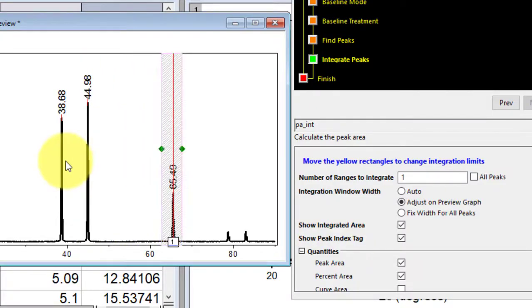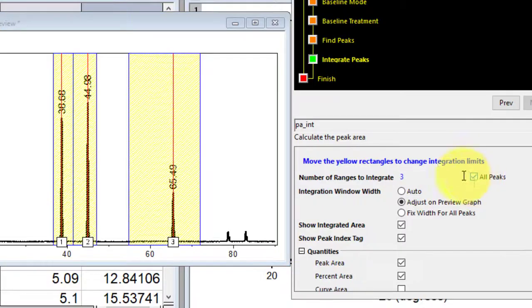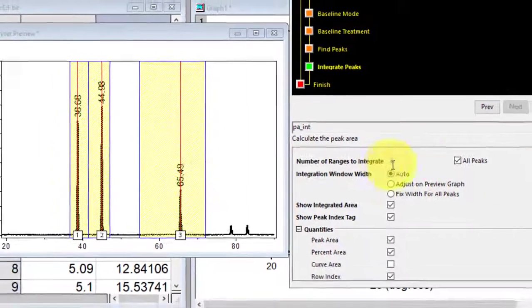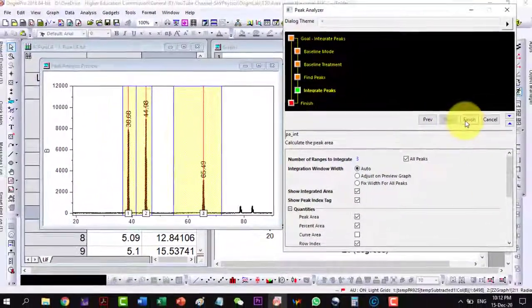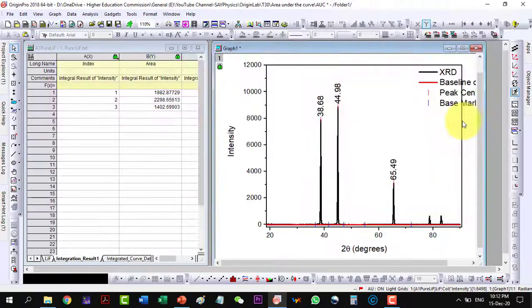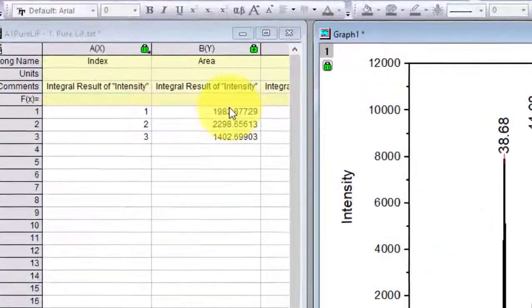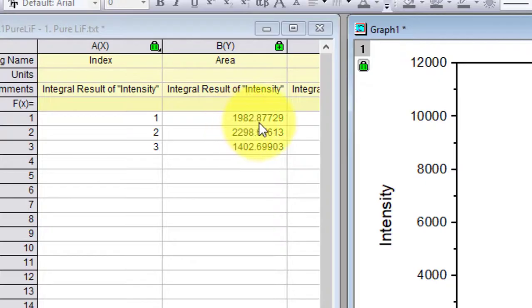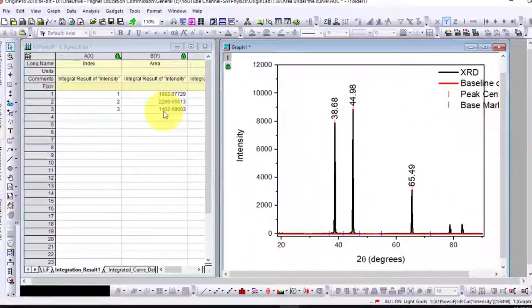So it can be done manually as well, but it is always better to find out the area under all peaks, so that less effort is done and we will have more information. All three peaks are selected, and I will click Finish. And here the area is: Peak one is having this much area, peak two having this much area, and peak three is with this much area.